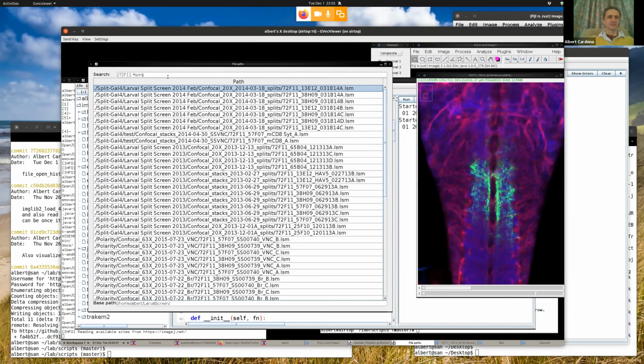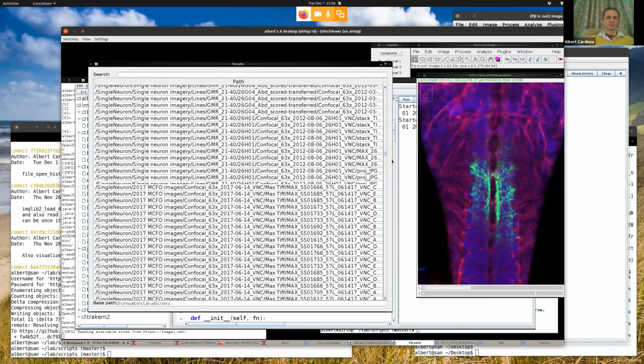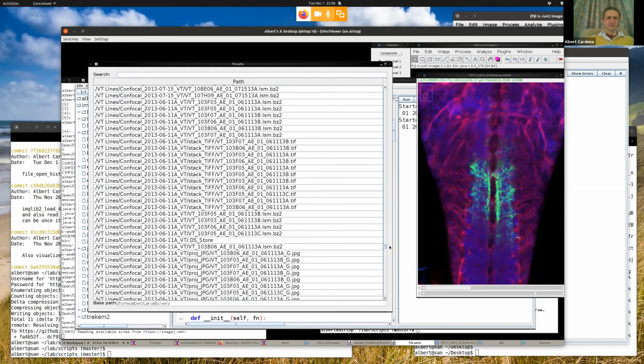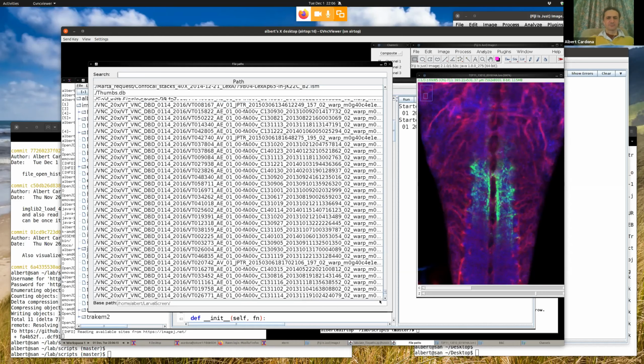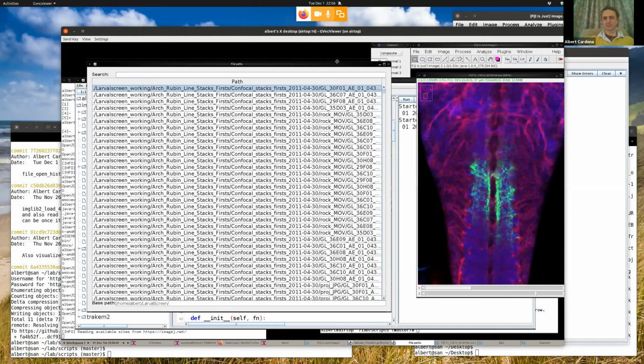And then in it, we see a search label. That's one component. Here is the text field where we can type what to search. I'm going to clear it. Enter a valid search screen. Sure. Right. And then what we see in here now in this table is this huge, enormous amount of files. I think at the last count, there were maybe 15 or 20,000. I lost track of that order. I don't think there's 100,000, but there's a number like that, in the tens of thousands.